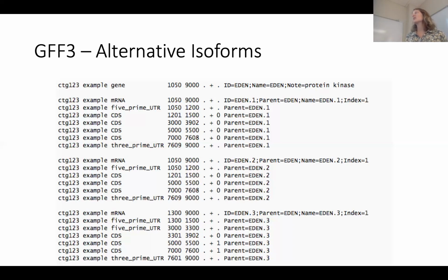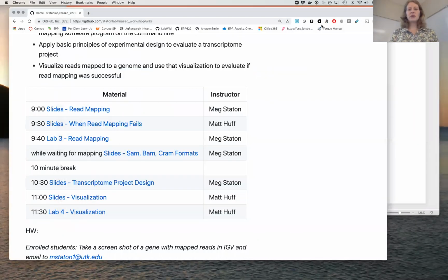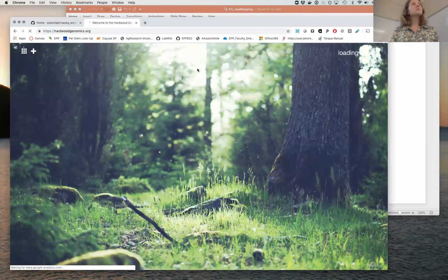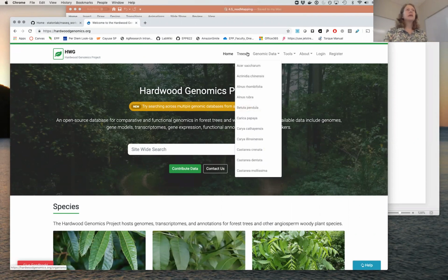We don't tend to store protein functional information in these files. The biggest utility of this file, other than mapping, is for building JBrowse or other types of browsers. So I can show you that. Let's see what we have. Right, yeah. The important thing is to have a unique ID that matches your actual sequence IDs and to have the parents sorted out correctly, to have the right parents. Whether or not it has functional annotation there is not that important.